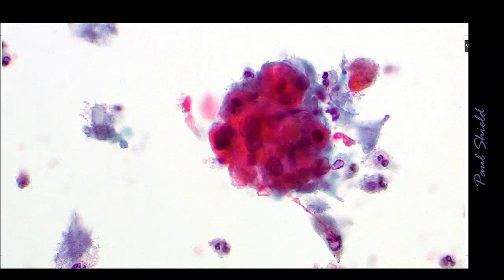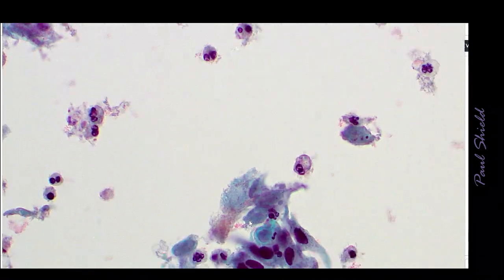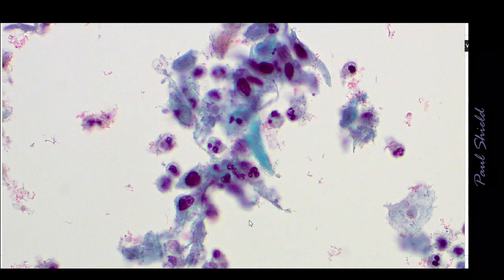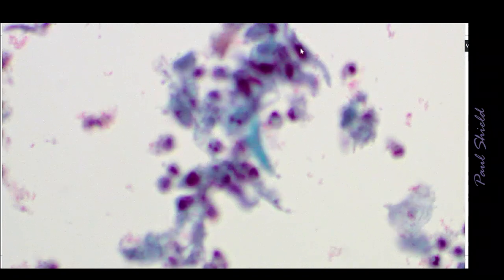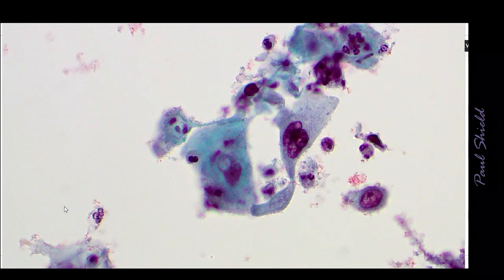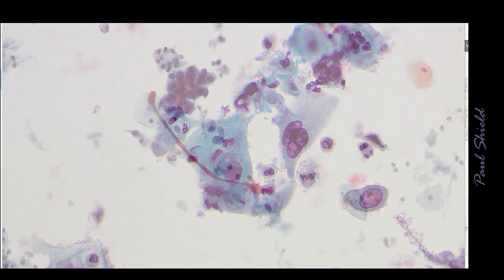These are very keratinized cells, typical of SCC, and there's some odd weird tails in them, and if you get an area that's good, you can focus and find, rather than nice round nuclei, you'll find quite angular ones. Often the chromatin is very opaque. It's a degeneration thing really. Notice how these nuclei are not at all round. They're quite elongate and quite dark staining, and those are almost spindle cells there. And again, they're clumped in amongst all that debris and necrosis. Quite abnormal looking nuclei there, and that one that's got 3 nuclei and a tail.